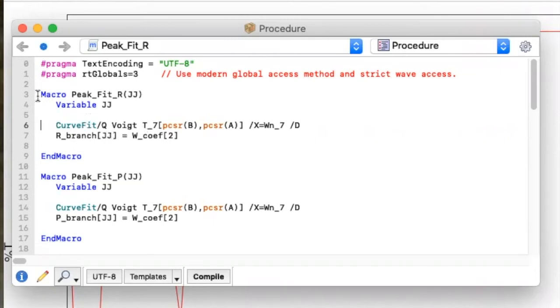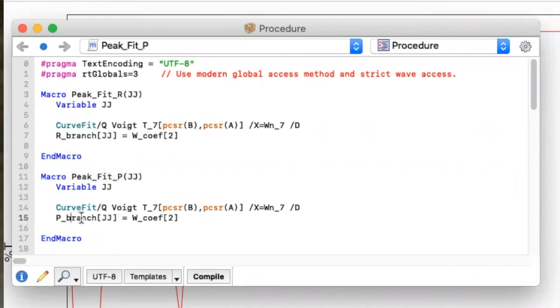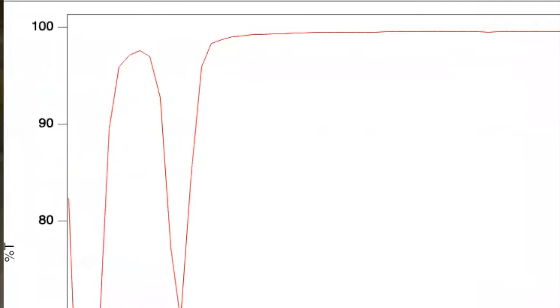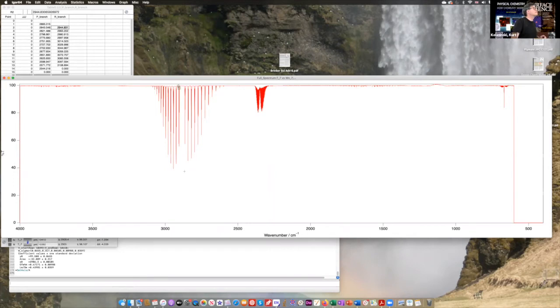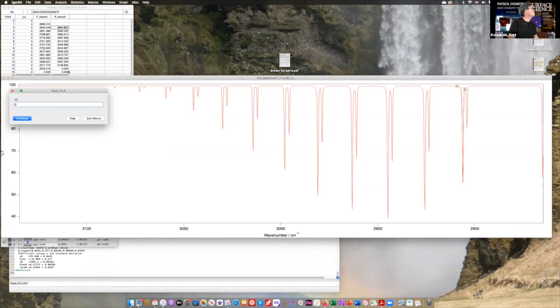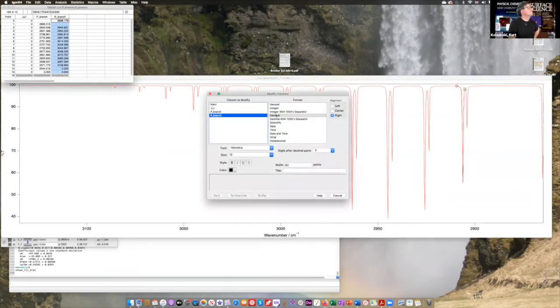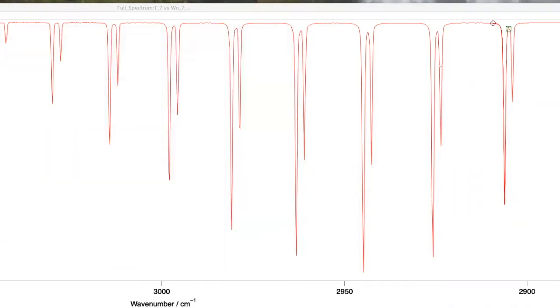I enter w_cof[2] — that's the central wave number — into a wave I call the R branch, because I have one macro for all the wave numbers from the R branch, and an identical one for the P branch storing values in a separate wave. I scale back out, identify the R branch peaks — the first peak in the R branch is for j equals zero. I choose the macro I wrote for the R branch, put in zero, hit return — it does the fit and puts the number up there to three decimal places.